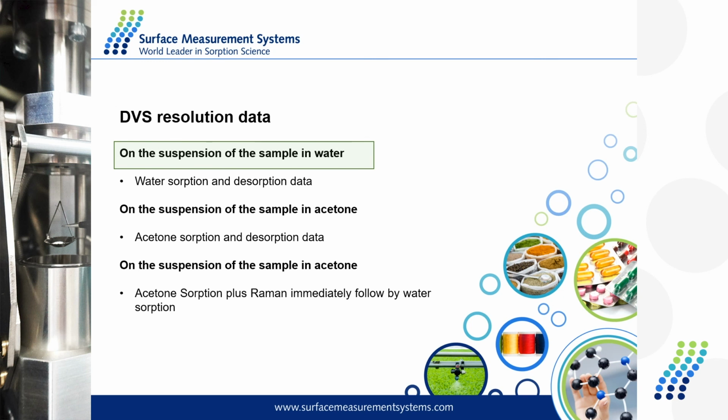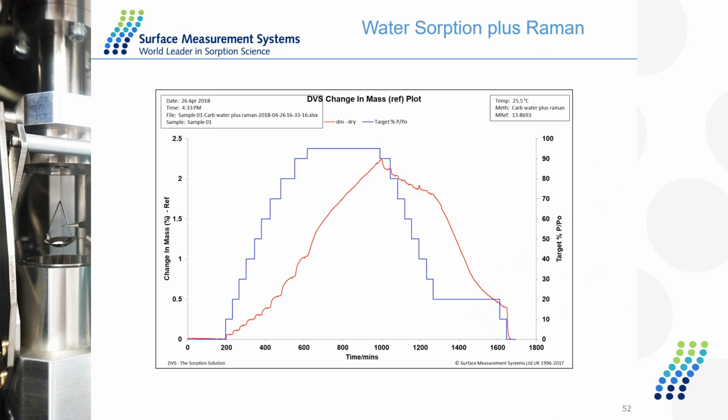So let's start from water absorption. Here is the kinetic plot of water. As you can see, the material forming a hydrate is a very slow process. It's not super defined because the mass uptake is slightly small.